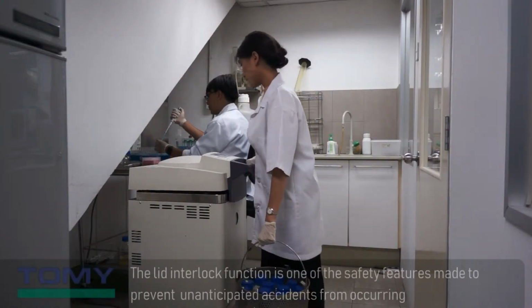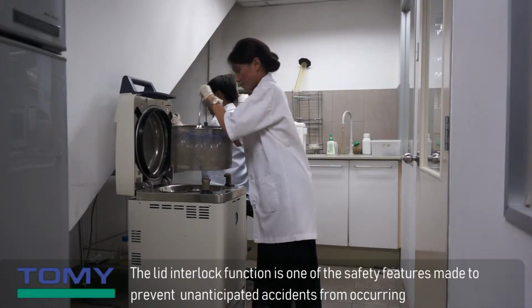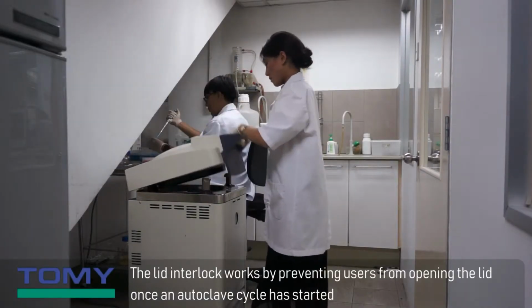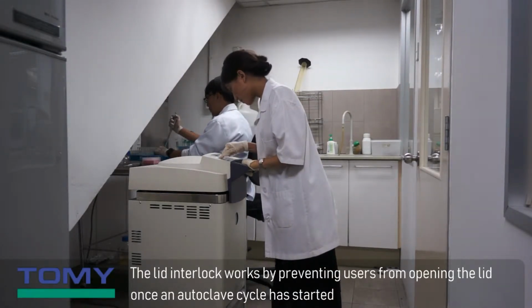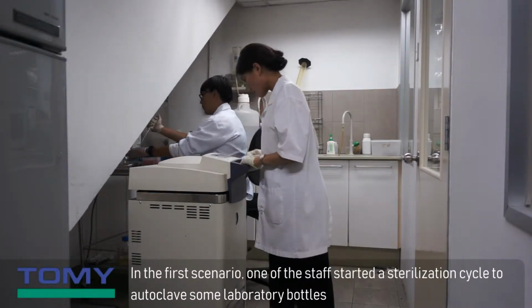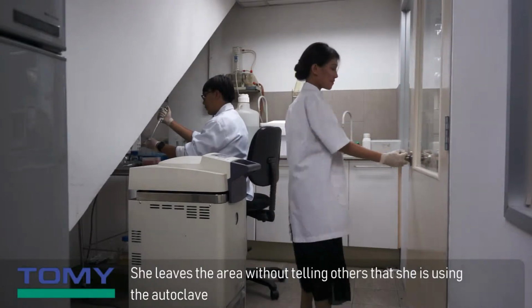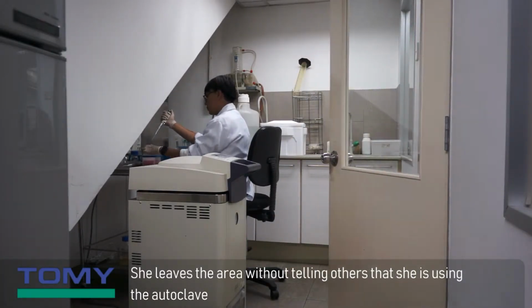The lid interlock function is one of the safety features made to prevent unanticipated accidents from occurring. The lid interlock works by preventing users from opening the lid once an autoclave cycle has started. In this scenario, one of the staff started a sterilization cycle to autoclave some laboratory bottles. The staff leaves the area without telling others that she is using the autoclave.